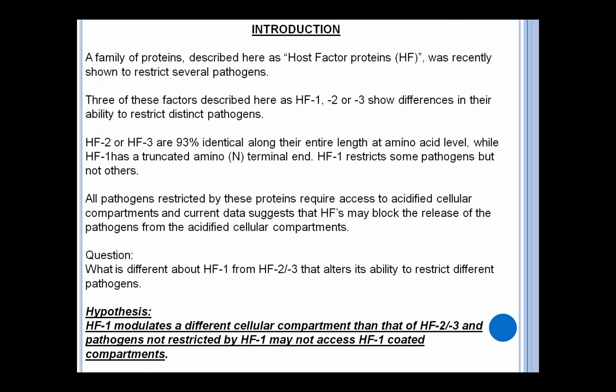Since the proteins or the host factors that were involved in this work were not presented, we renamed the factors as host factor 1, 2, and 3, and the pathogen as pathogen X. Coming back to these factors, the host factors were recently shown to restrict several pathogens, and 3 of these factors, which we call HF1, 2, and 3, show differences in their ability to restrict distinct pathogens.